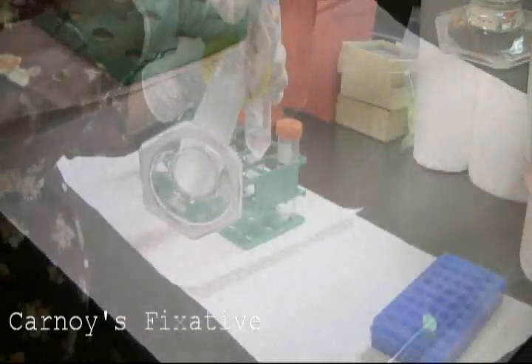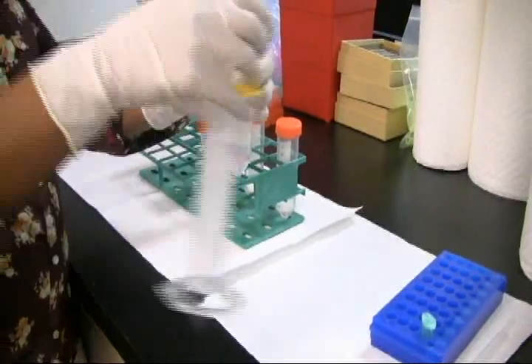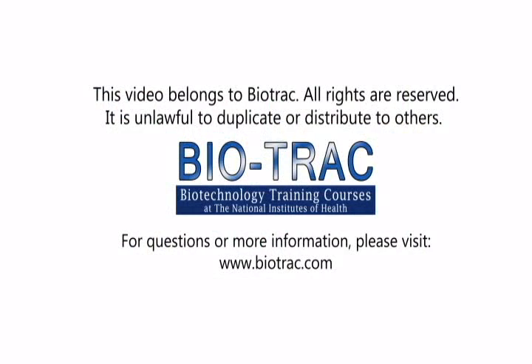Re-suspend the tubes in 20 mL of Carnoy's fixative.